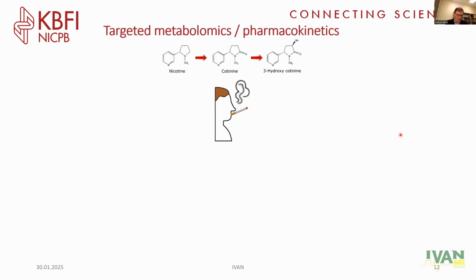So once we had this in check in a biofluid sample under control, we wanted to do something useful with it, basically to show that this can be a useful targeted metabolomics tool to measure something. So we figured that we will measure something that we know what the correct value is, but you cannot do it by normal NMR because of the sensitivity and resolution reasons already covered.